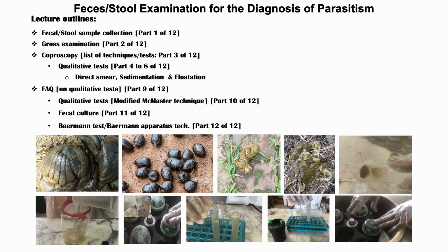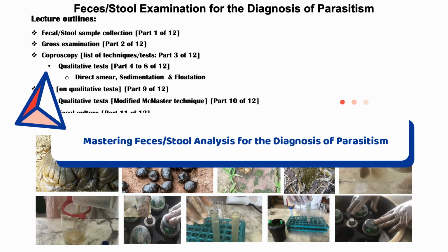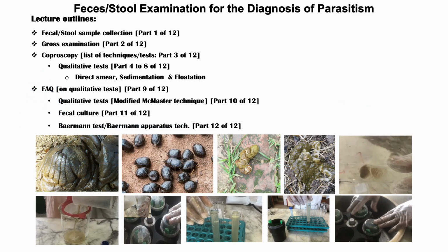In this lecture, I'll discuss tests related to feces or stool for the diagnosis of parasitism in animals as well as in humans. The title of today's video lecture is Mastering Feces or Stool Analysis for the Diagnosis of Parasitism. This video lecture comprises 12 parts or sections.